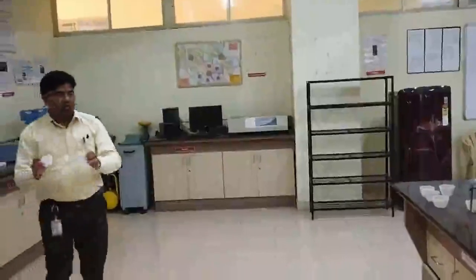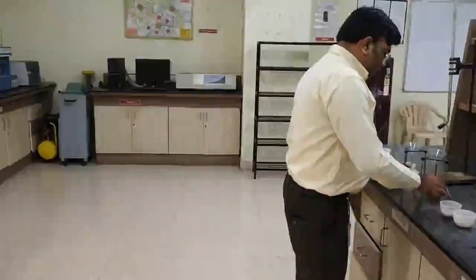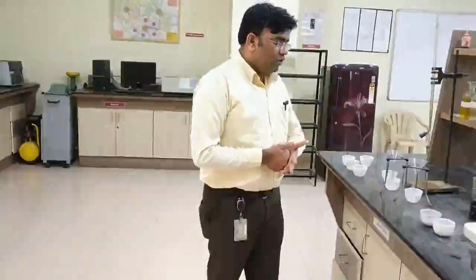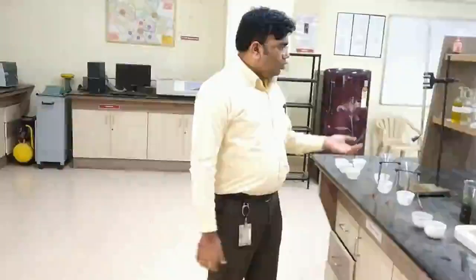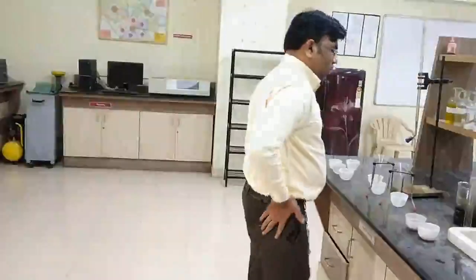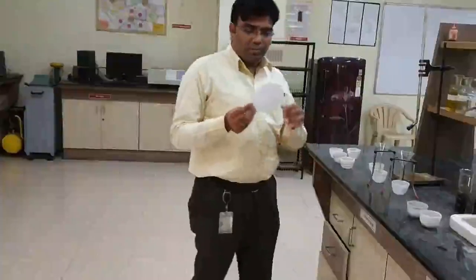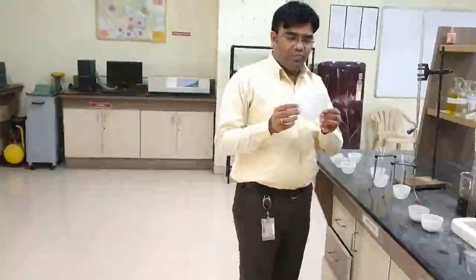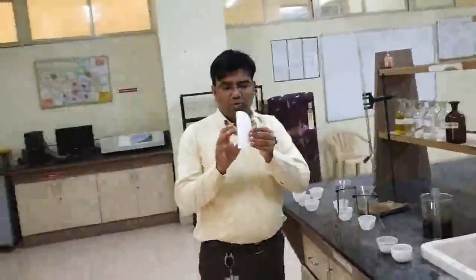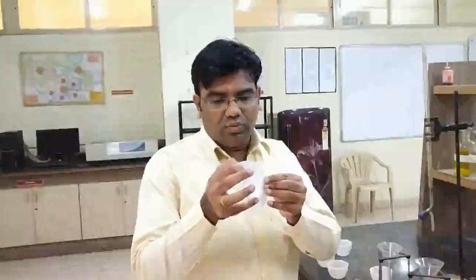So I am going to take an empty crucible for this, and for the total dissolved solids, what we require is the filtrate. We don't require the original sample. If the original sample is taken, the suspended solids will also be present here. So we are going to remove the suspended solids with the help of this filter paper. It is Whatman filter paper number 40. It is to be properly folded in this manner. So I am going to fold this. It is a very easy fold.